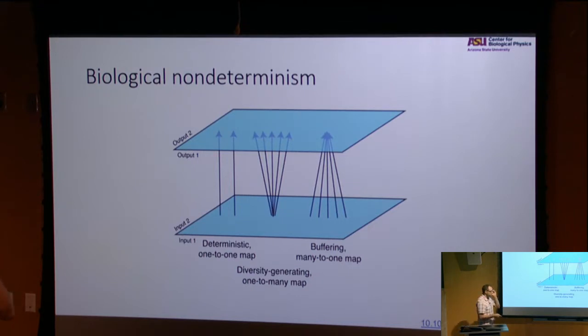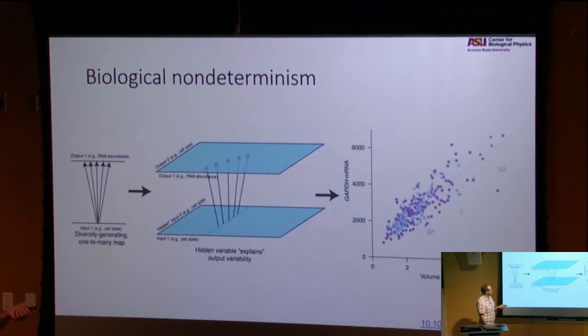So what was interesting is when I started working on this was about when a set of tools came out to actually probe the actual molecular contents, like let's say count the number of RNA in every cell using both imaging and molecular biology techniques. And so, you could start to ask, well, can I do a better job? And can I ask, what is actually controlling this? And one thing you could say is maybe I just didn't measure enough. And so in this particular case, what I've plotted here is data from Arjun Raj's lab at Penn.